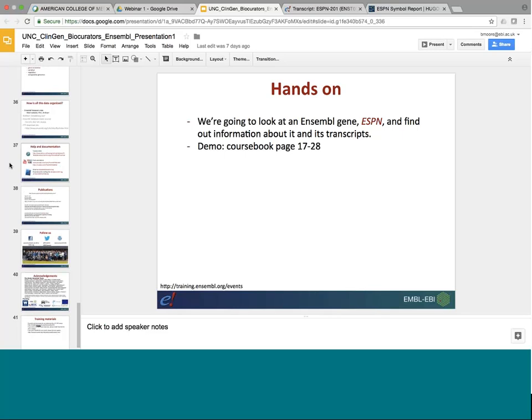So would you recommend that if people weren't able to attend today but are planning to come next time, they should listen to the introduction from today? Yeah, I think it would be helpful. You could also follow along if you have some experience using Ensembl before, but what we're going to cover in the next webinar does build on a lot of the things that we covered today, so you might feel a little bit lost if you haven't watched this webinar. Okay, that's good to know. I'll make sure that people are aware of that if they weren't able to attend today.